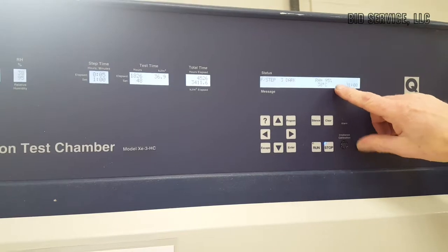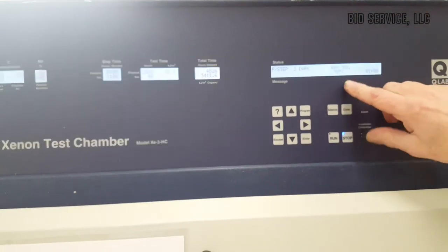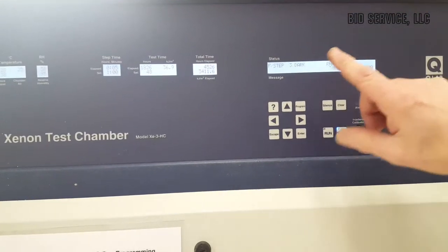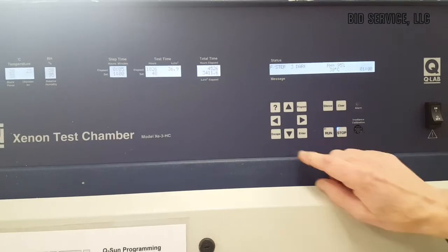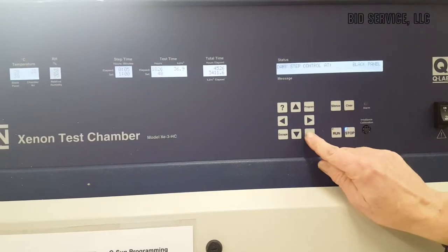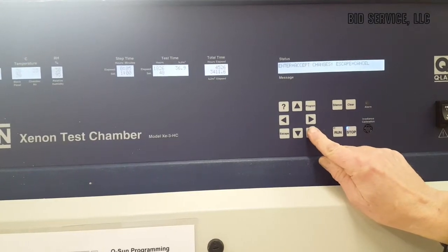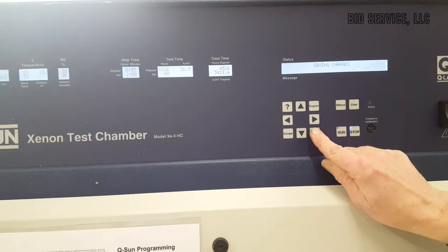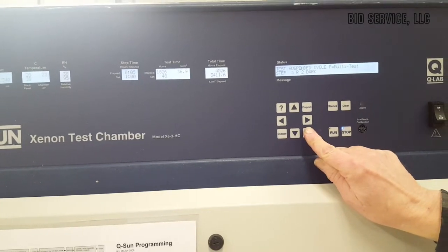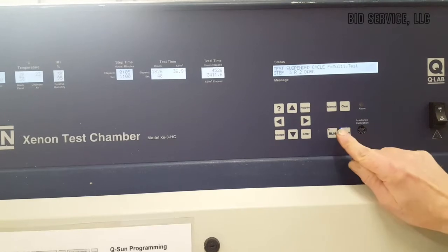I'm still going to run this way up, keep this at 38, but I'm going to do it in the dark. So I will enter, enter, accept those changes. And here we go.